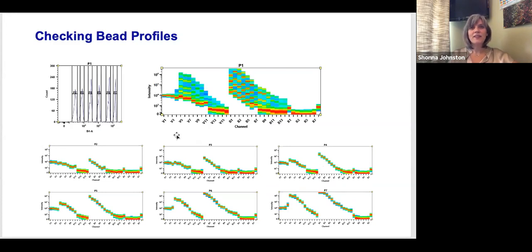Something else that we did is we quite often use GFP beads. We have commercially bought ones that we use for doing compensation on our filter-based systems. They work grand. What you're looking for in the filter-based systems is not really between a negative and a positive, it's between a weaker signal and a higher signal, just 2 data points.